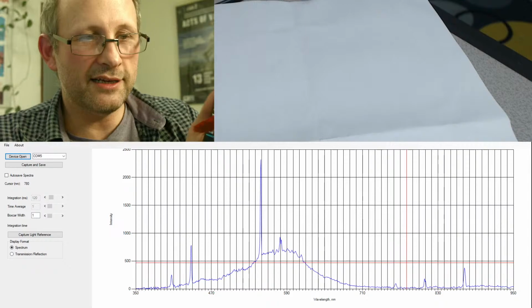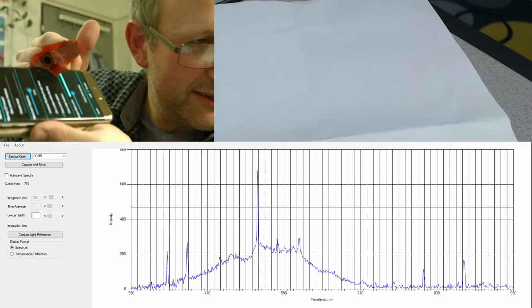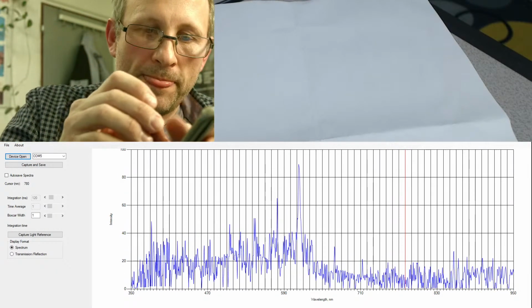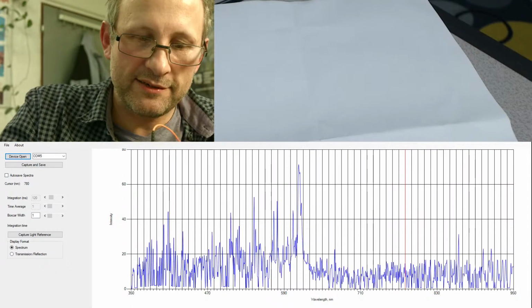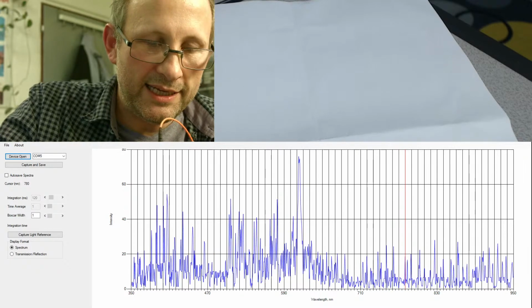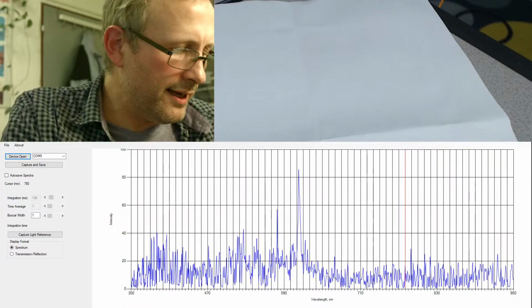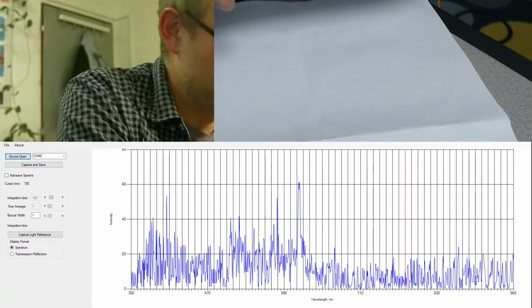You can see there's a little black area there, so that's going to sit down on that area, and we can put that down there. And what you can see right now, as I close this off on the live feed, is just noise. That just goes to show how good these Samsung displays are.